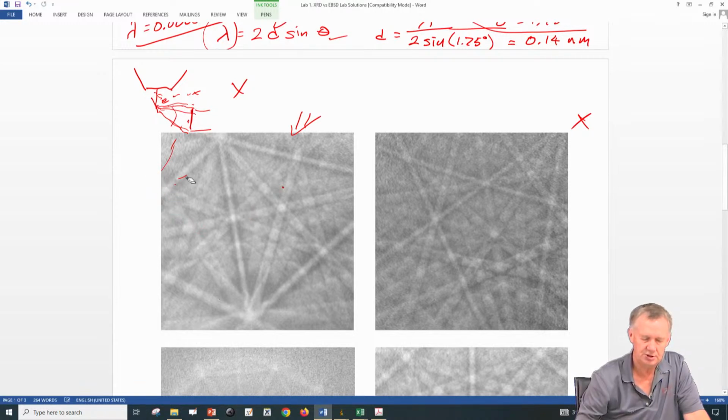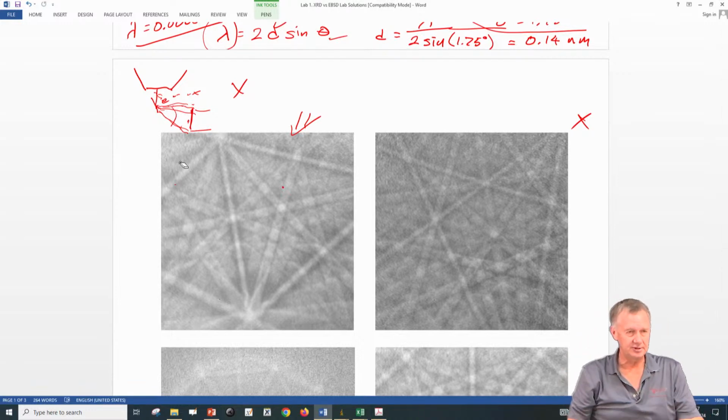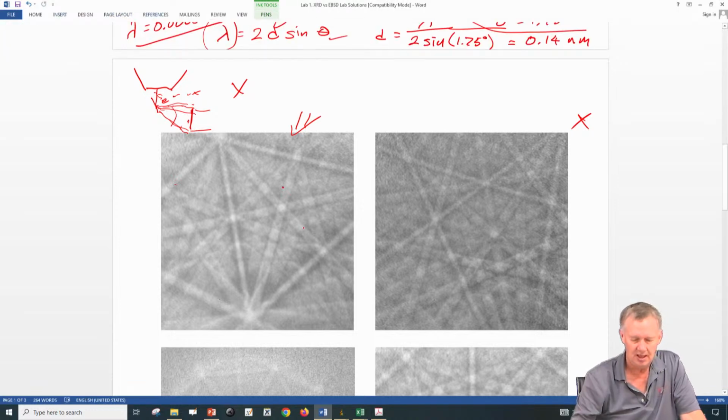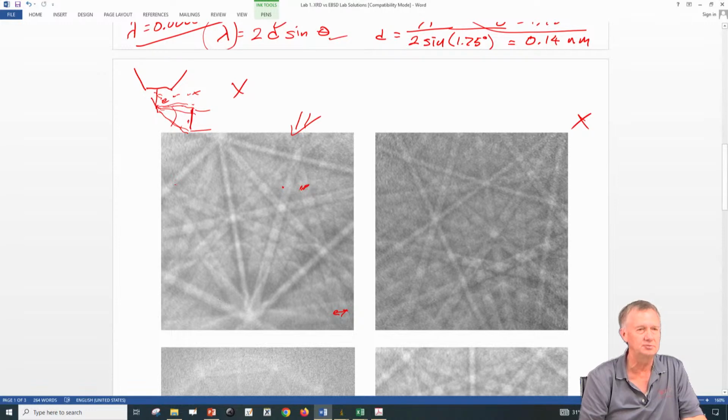Sir, yes, question. For the pattern center, do we have to take a specific band or can we take any bands? So the pattern center is determined independently of what the orientation of the crystal is, right? When I was drawing it from the specimen, it was from a single pattern without knowing the pattern center, and I was just looking at any bands. What I was trying to do was look at the ones that were the most exaggerated, right? This one I could have used, where it's much wider here than it is down here. That's a smaller distance, right? And so I go to wherever it's smallest and take that normal. So I could have used any 2 bands or 3 bands or 6 bands. They should all fit right at the pattern center. Okay.